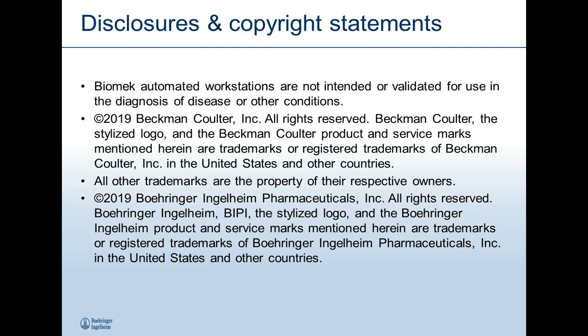It does have to be a very methodical approach, and that is a big reason why I never recommend developing methodologies on automation platforms. I would highly recommend developing them manually at the bench and then transferring to an automated platform. It takes a whole set of variables off the table if you do start to see problems.